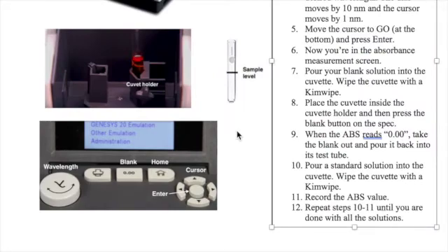Make sure not to use a paper towel as they will introduce lint and scratches to the cuvette. Put the cuvette into the cuvette holder as shown here. Record the absorbance you see on the screen.